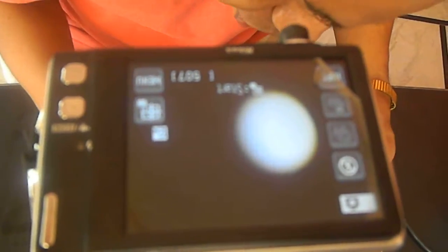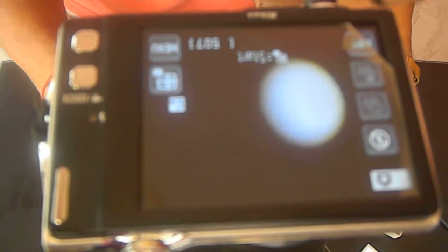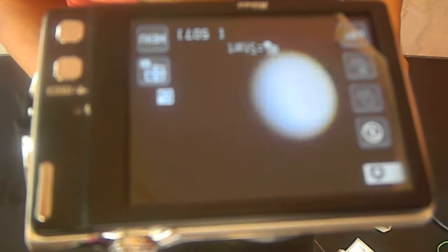Now I am focusing the slide which is visible to me through the eyepiece. There are eyepieces in this microscope. Sometimes we provide the changeable system so that you can see the slide which is coming in focus and the image which will be visible on both the sides. Clearly now you can see this image is coming.